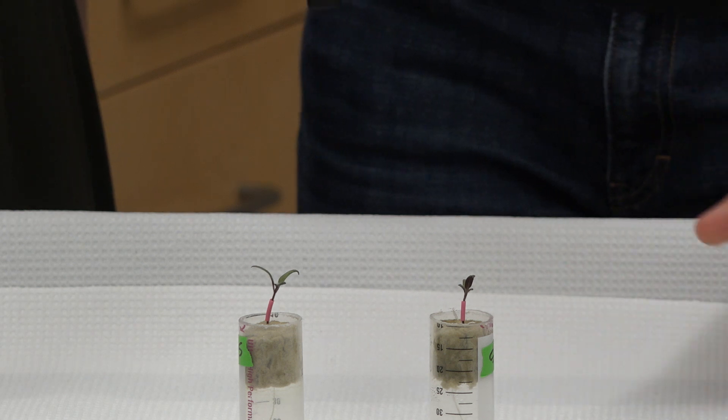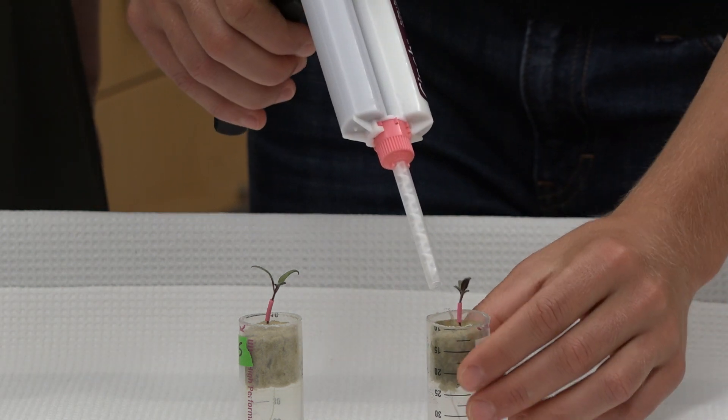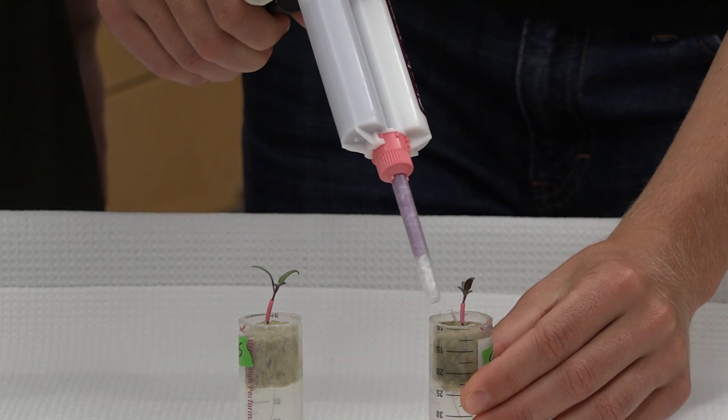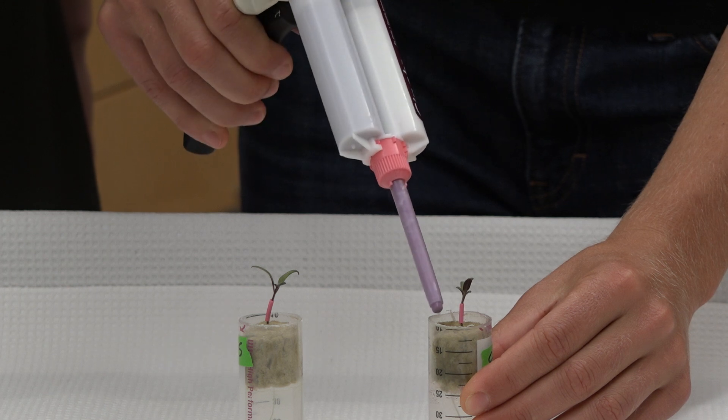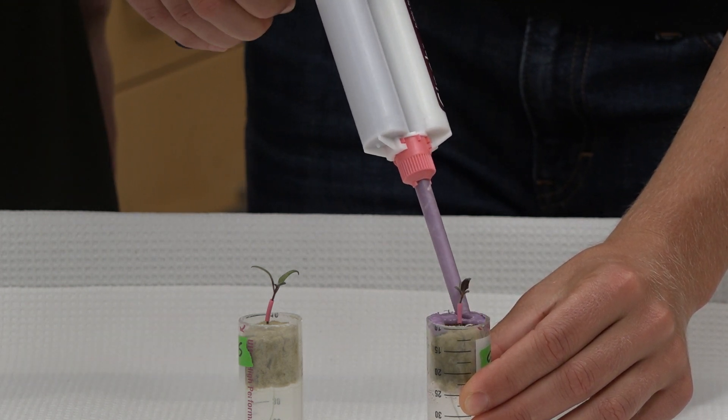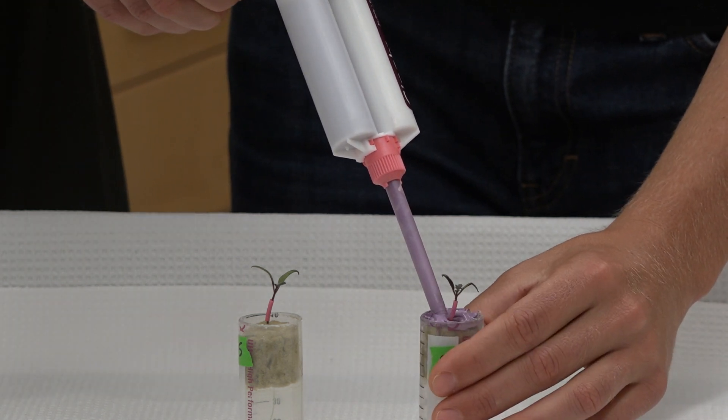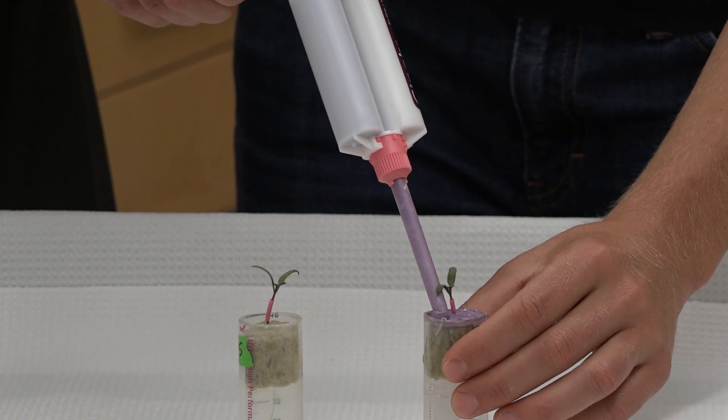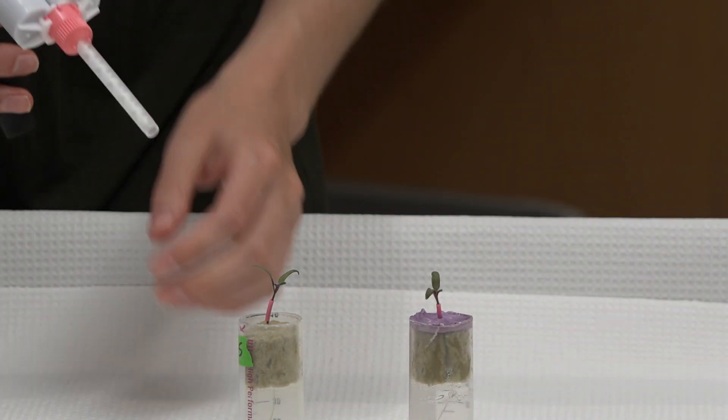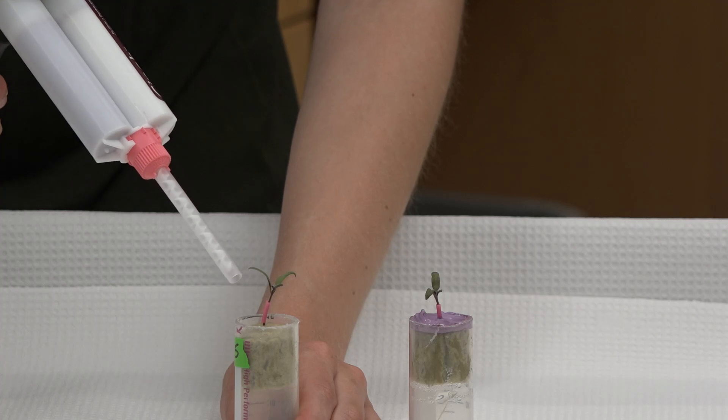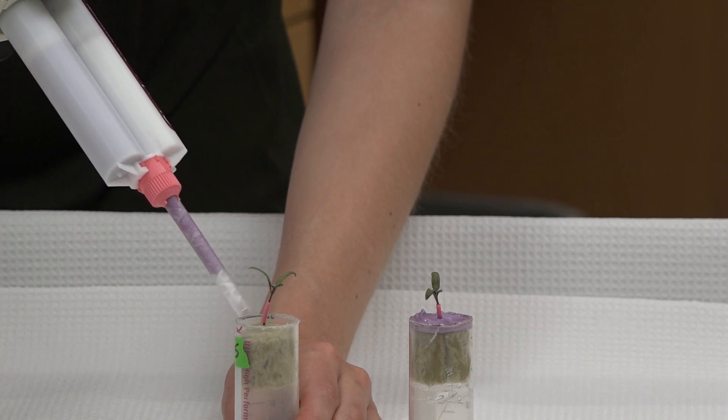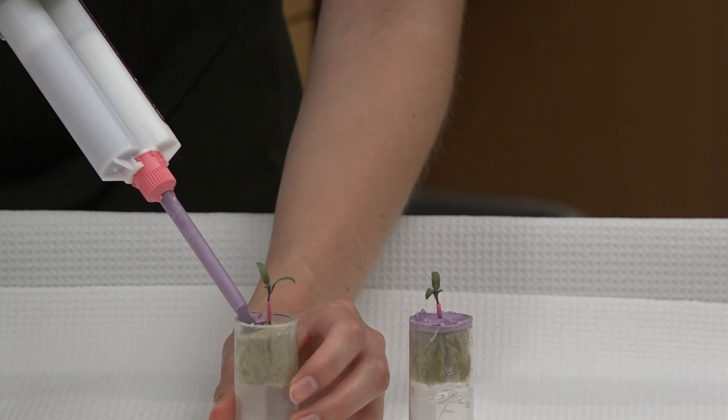So to prepare these plants for the PET imager, we're going to seal them off so that we can feed them the radioactive carbon dioxide. To seal these plants, we use dental impression media. This is the same product that dentists use to take impressions of your teeth. And it can make an airtight seal around the base of the plant. Do you want to do one, Molly? Yes, so badly. You get 90 seconds before it hardens. Wait, really? Oh my gosh, okay. A lot of pressure. Pressure's on. Seal it.